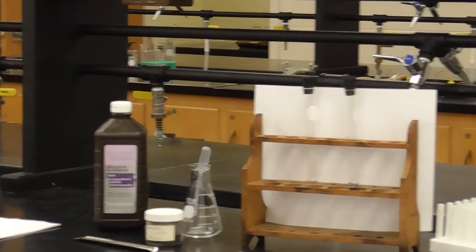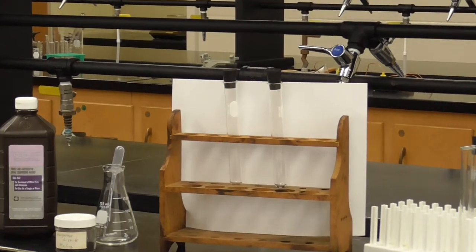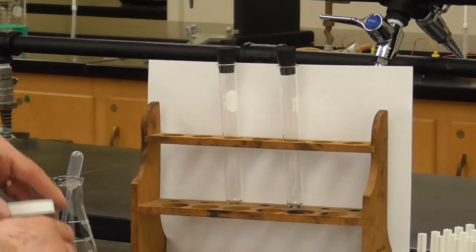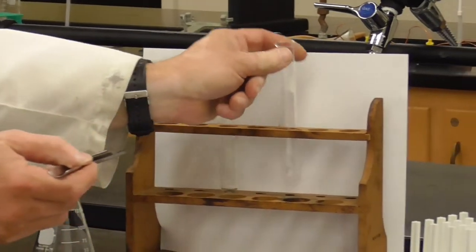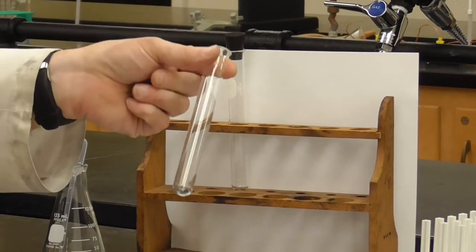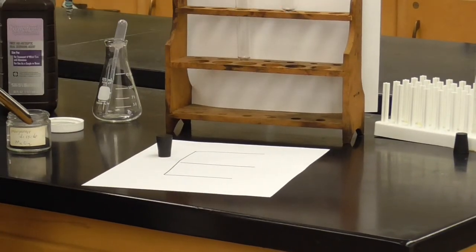We've got two test tubes. One, we'll just put some hydrogen peroxide in and watch it decompose, or trying to decompose anyway. And the second one, we'll put some manganese dioxide in. All right, so let me do that first, actually, just to get that ready to go. It doesn't take a whole lot. I'm just going to do a little scoopful and put that into the second test tube, like there. Hopefully you can see that. How's that? A little bit of manganese dioxide in the bottom of that test tube.